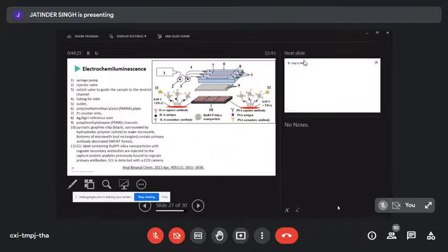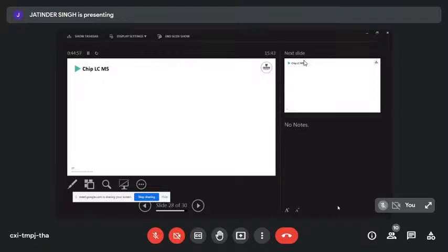And then we've got a block here that contains an electrode with some hydrophobic barriers to contain the liquid in place. That's got a patch sitting there on the bottom that contains the antibodies as well as the electrochemiluminescence reagents. And this whole system makes then an array of 9 different detector spots. And with those 9 spots, we can, from 3 different samples, measure 3 different lines.